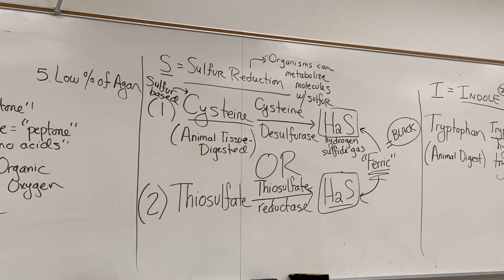And pyruvate is great because pyruvate is kind of that fork in the road. It's a really important molecule that bacteria can use to build their ATP. So we have that. But then there's kind of just another byproduct. So it's not just the pyruvate, but there's also, I'm going to put a plus down here, another byproduct that is made too. We just call it indole.